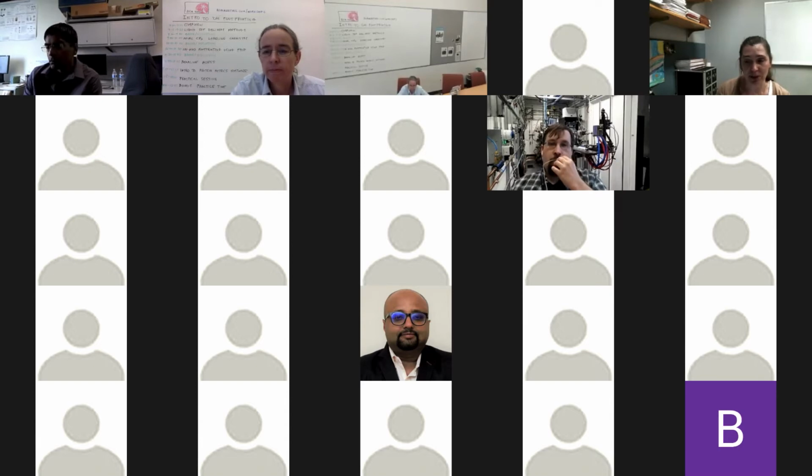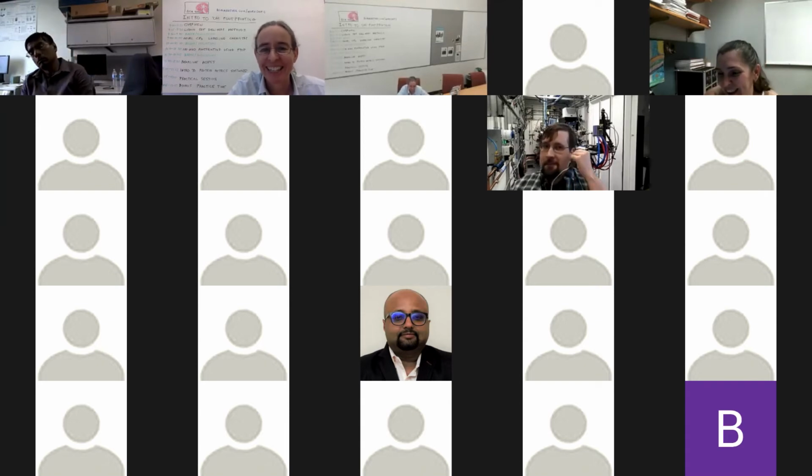after we're done with the chemistry, we're still quenching with methionine amide, because you still observe oxidation of methionine with a hydroxyl radical. That's to prevent methionine from further oxidation in solution, so that's where we add quencher. But otherwise, we will consider not adding quencher and see how it goes. We're testing this on a peptide level right now to see if we need any additional quencher. Nice question. Great question, thanks, Eric.